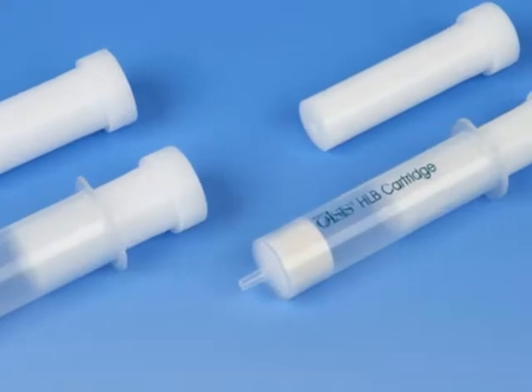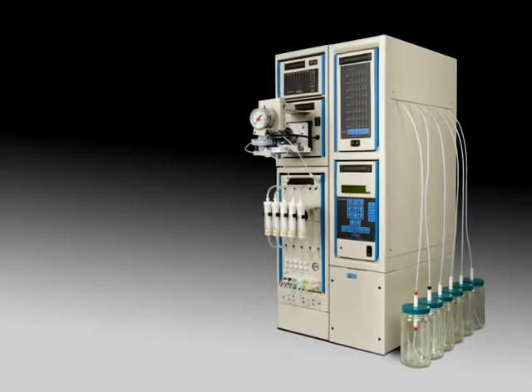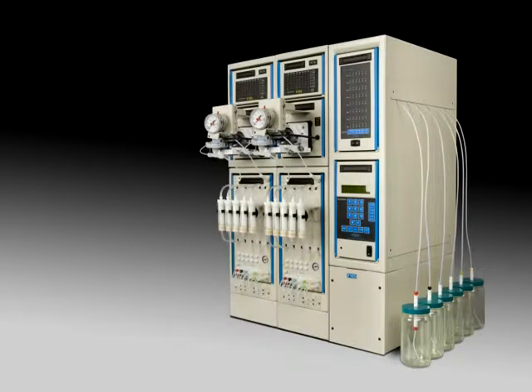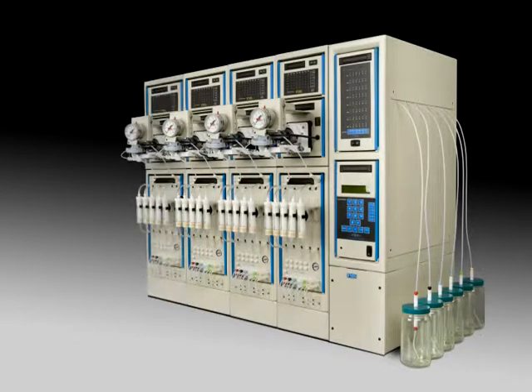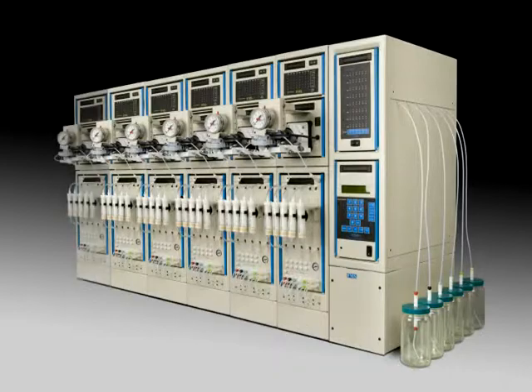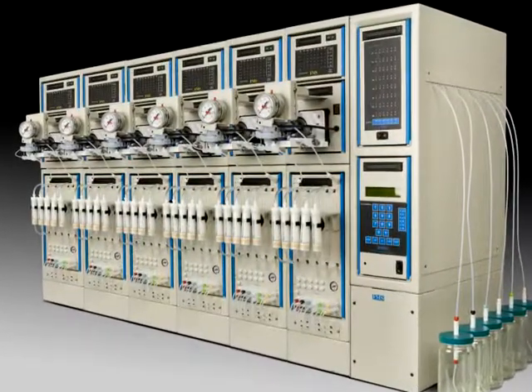In addition, the PowerPrep SPE system is expandable. It will grow with your laboratory as your sample load increases. The system can grow from one to six modules and all run simultaneously. Each module is capable of running five samples sequentially, giving the laboratory the possibility of loading 30 samples at one time for totally unattended operation.